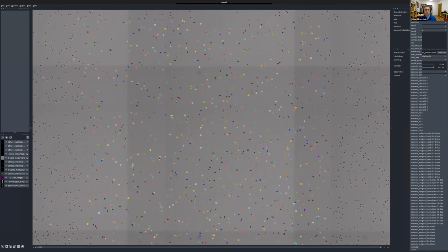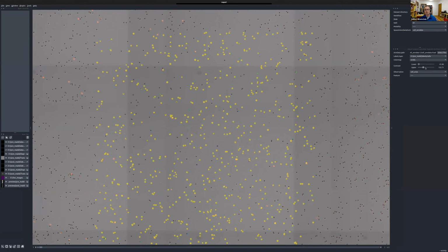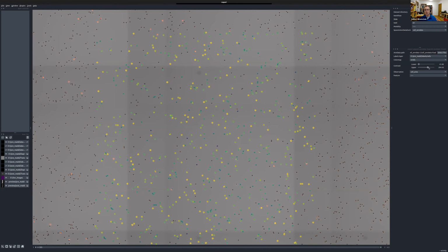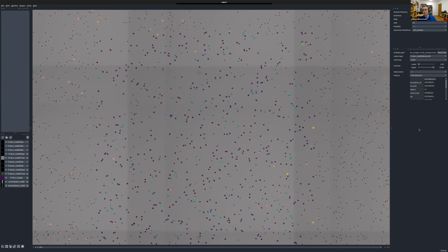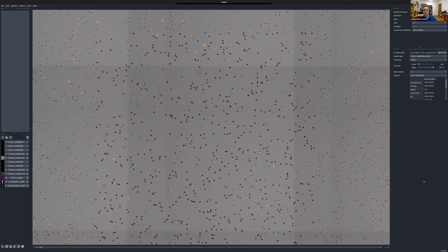So this is a bit unfortunate with this example because these are T cells, they're all round, so you don't have huge differences in cell area, but maybe if I up the contrast, oops, now I saturate the contrast a bit there. But you can do heat maps for all of the morphological features you derive. This would be more convincing if I did it on HeLa cells or other cells where you have other phenotypes. And of course, we can do the same for molecules. Pick a molecule and have it visualized as a heat map on top of your segmentation results.